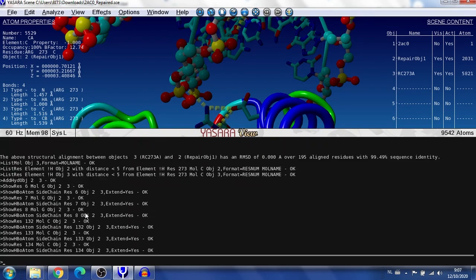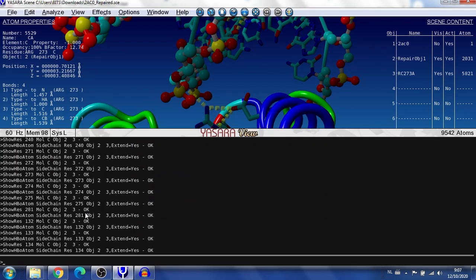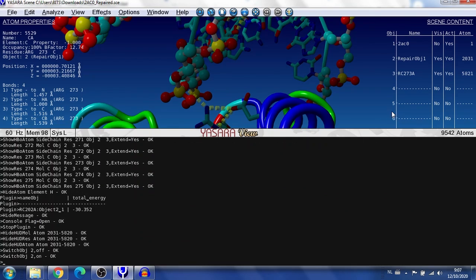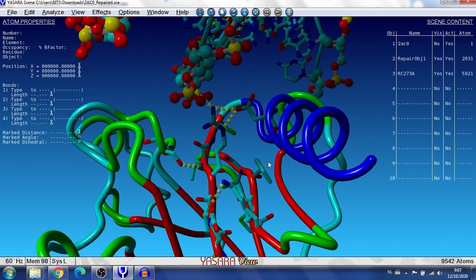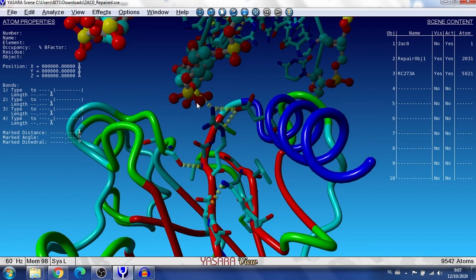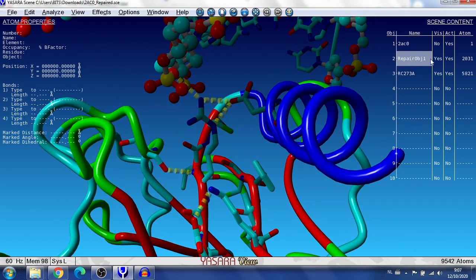So I just have to look whether I see the other examples as well. So it's not there. Okay. Good. So then we will do it by hand. Just trying to find out. So this is interaction energy we would like to calculate with the chain G effect. So let's see how we can do this from the repaired object.